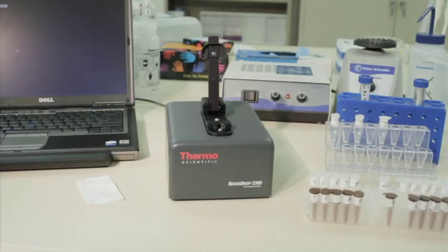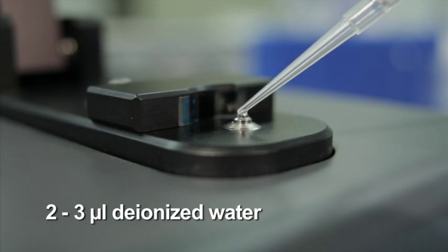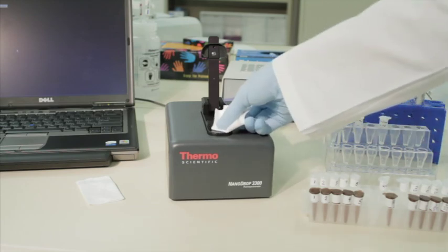To prepare the instrument and perform measurements, first clean the lower and upper surfaces of the sample retention system. Pipet 2 to 3 microliters of deionized water onto the lower optical surface. Close, then open the lever arm, and blot the upper and lower pedestals with a clean, lint-free laboratory wipe.